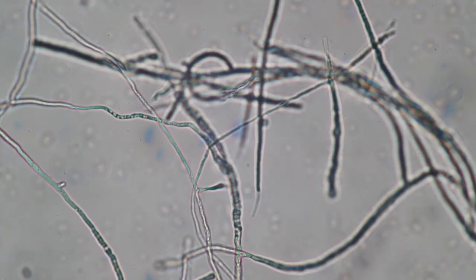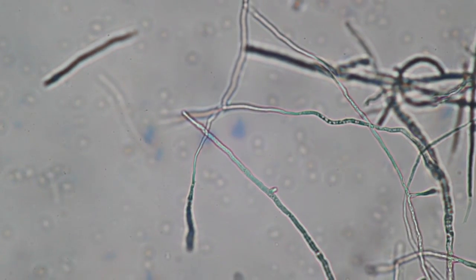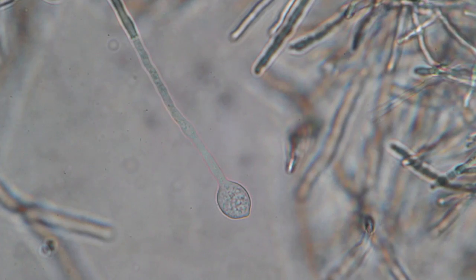Here again at slightly higher magnification, you can even see some of the cell organelles inside the cells.